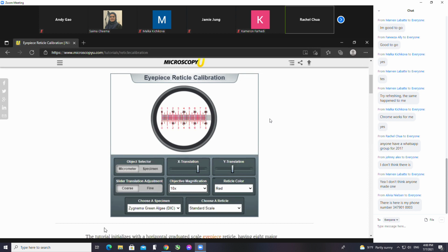Can you repeat one more time? Yeah, so divisions are the individual lines, right? So there aren't 8 divisions. I'm going to take away the stage micrometer. There aren't just 8 divisions. A division is this small line that you're seeing.